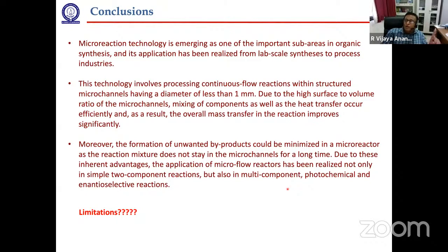Suppose one of the components is not soluble in the solvent, we cannot use microreaction technology, because these compounds will go inside and block the microreactor, so we cannot use that microreactor anymore. So only homogeneous reactions can be done in microreaction technology, at least at lab scale, because the diameter of the microchannels is very, very small. That is the main limitation of this technology.